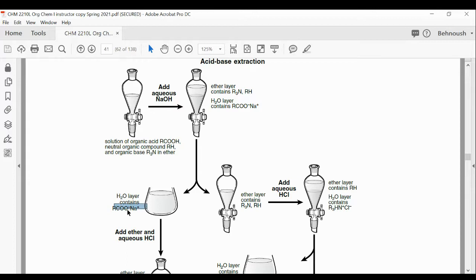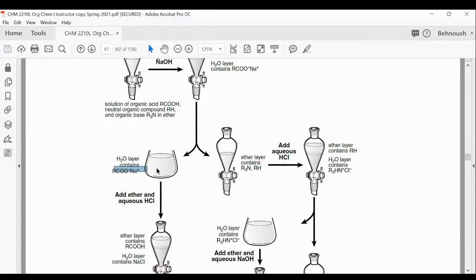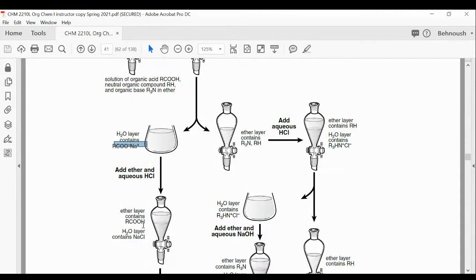And that's not what we want. We don't want the aqueous layer. We don't want a liquid to recover it, because our benzoic acid used to be solid at room temperature. So if you add HCl, HCl reacts with sodium benzoate, is going to remove sodium and bring back hydrogen. Sodium goes with Cl, so you will get the benzoic acid. Benzoic acid does not dissolve in water at room temperature. And we saw that in experiment 1, benzoic acid did not dissolve in water at room temperature. So you will see that precipitate, and when you see that precipitate, you collect it.